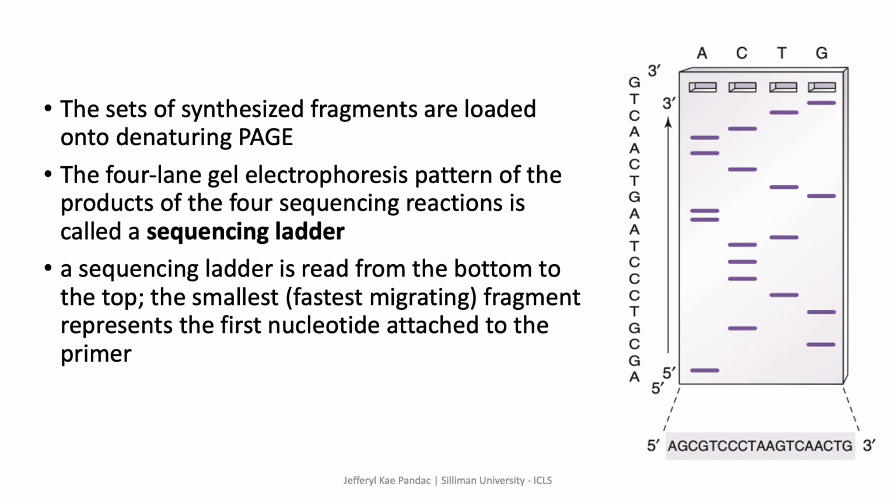From the bottom of the gel, the smallest or the fastest migrating fragment is the one in which synthesis is terminated closest to the primer.